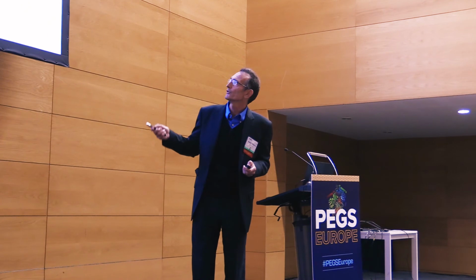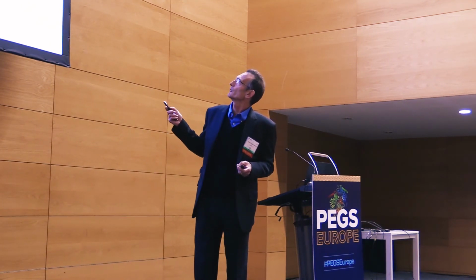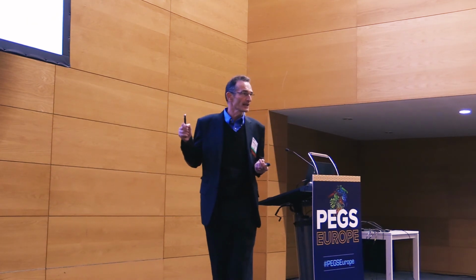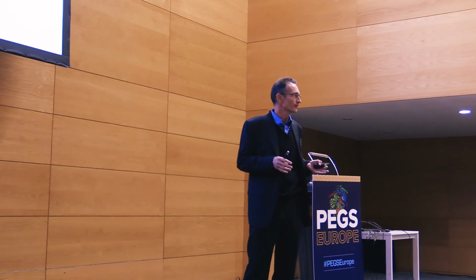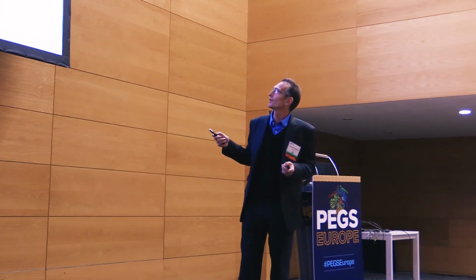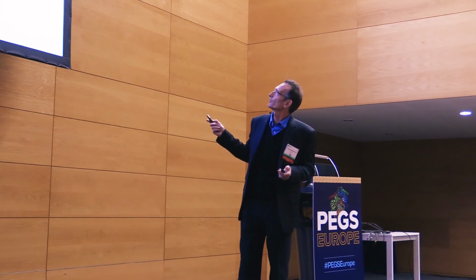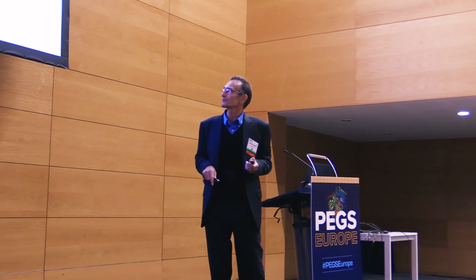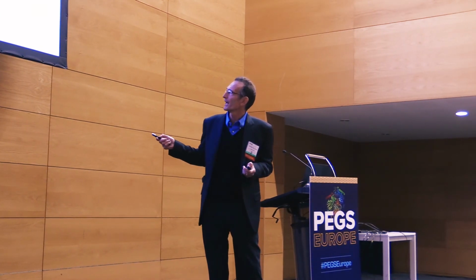Now, these were carried out using these different assays, and the antibodies that we were using were sirukumab, which, as I mentioned before, is the bad antibody. It's an antibody that's out there against IL-6 that has seven different liabilities in it. We used the parental scaffold antibodies for each of these to provide us with a baseline, and then 4 selected clones from each library. So this, just to remind you, sirukumab down here, bad antibody.